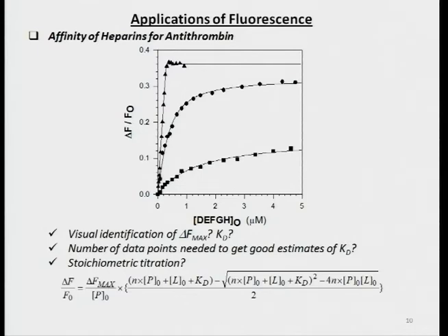But a number of times that's simply not possible because we don't really have enough GAG or ligand to bind. So how many data points do you really need to define this curve? You need about 3 data points on this axis, 3 data points that define a curve, and then 3 data points to define this line, which is a linear profile.